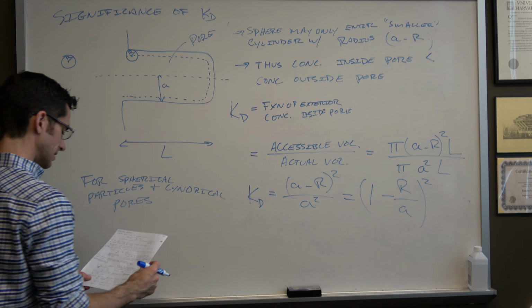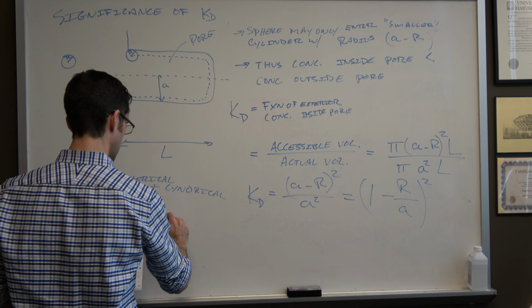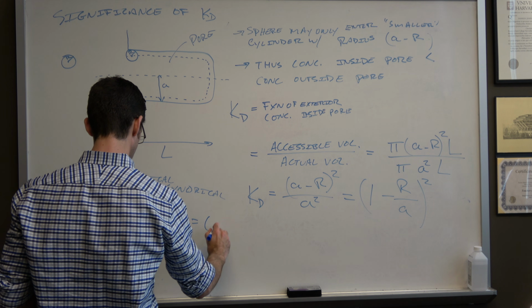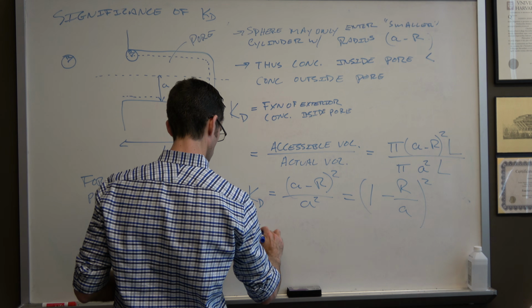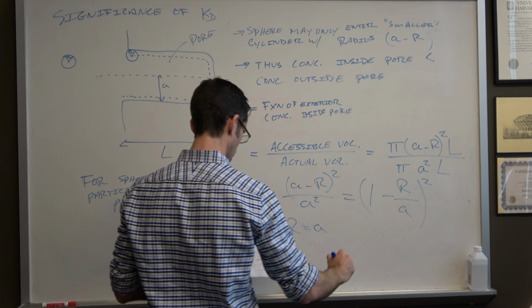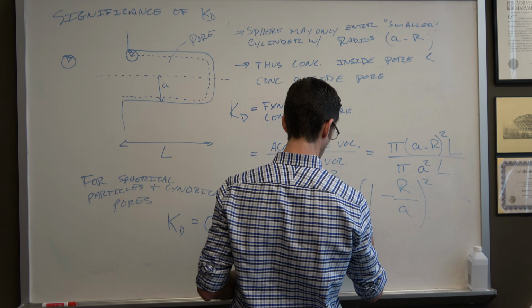So in the two limiting cases, KD equals 0 for R equals A, and therefore the solute is excluded from the pores.